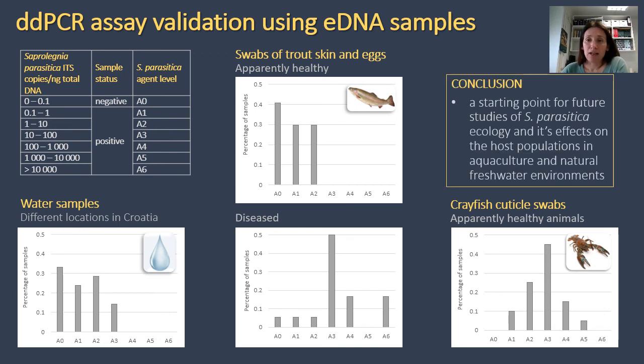And therefore, I can conclude that our assay is applicable in Saprolegnia parasitica monitoring in aquaculture and natural environments, and it presents a starting point for future studies of this pathogen's ecology.